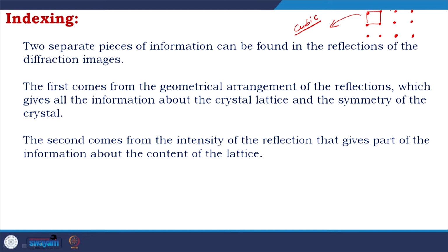You choose something which is in a different setting, and both are possible. So, whatever your crystal is, whatever experiment you are doing, even if A and B are doing identical experiments, they could come up with different unit cells. Choice of unit cell depends on your choice of model.